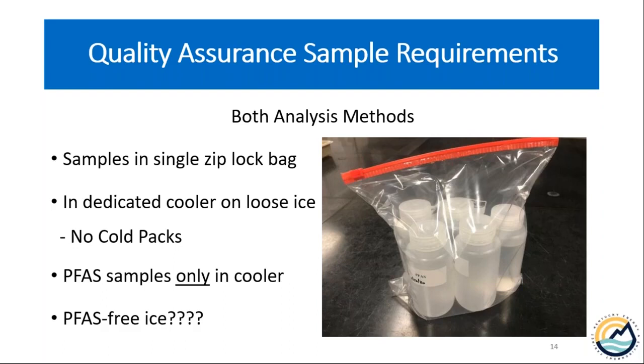So the entire time that we were conducting that study, we knew that our ice had very low levels, but did have PFAS in it. So we were extremely cautious, making sure that everything was sealed. And in many cases, we would go to the lengths of double bagging our samples before putting them in the cooler. And I can tell you that doing that, all of our field blanks and trip blanks came back clean.